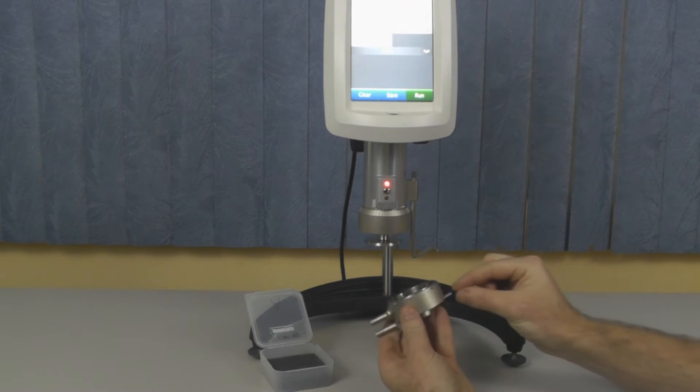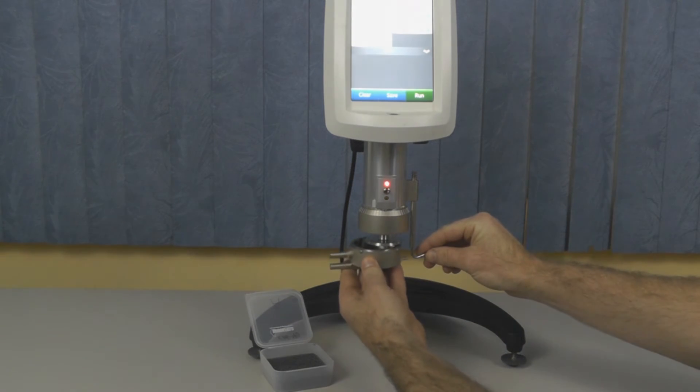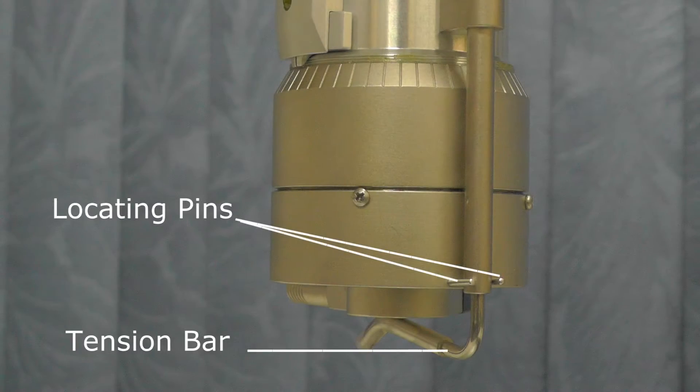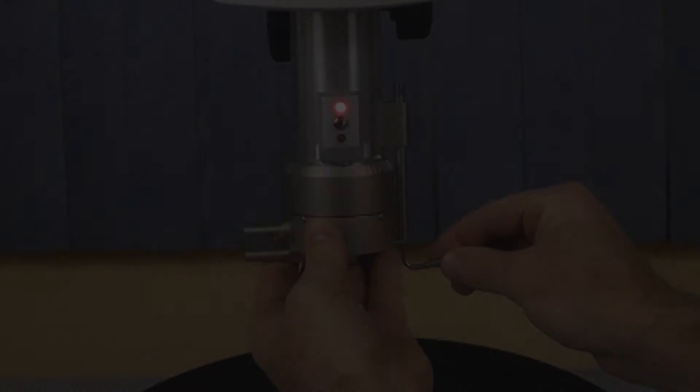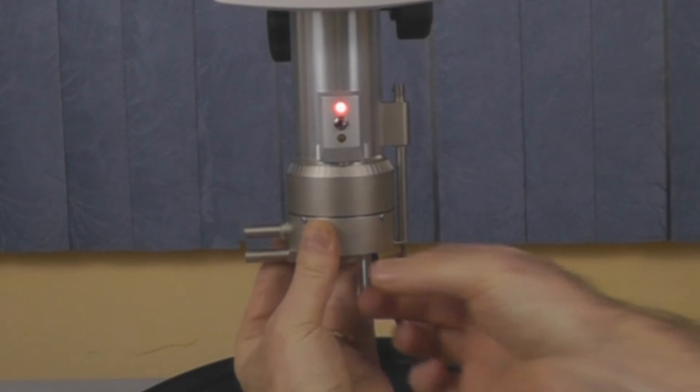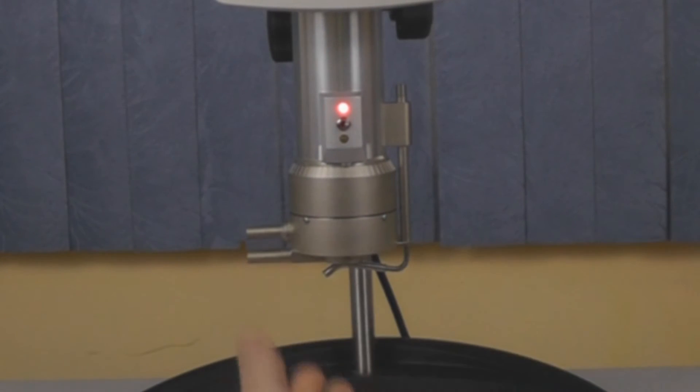You then attach the sample cup to the instrument so the two locating pins straddle the tension bar. This is to be done without any material on the sample cup. You then lock the sample cup in place by moving the tension bar under the cup.